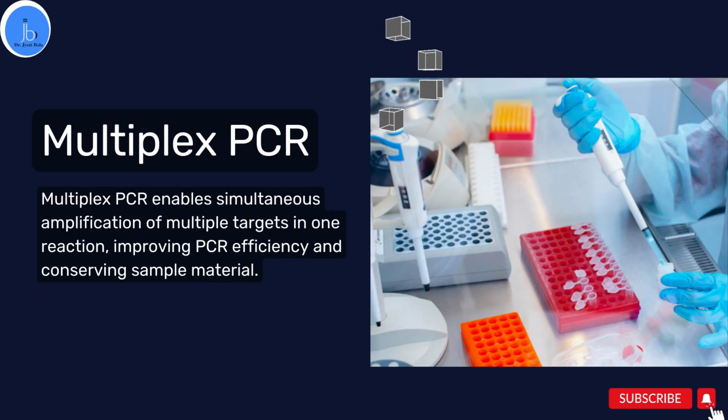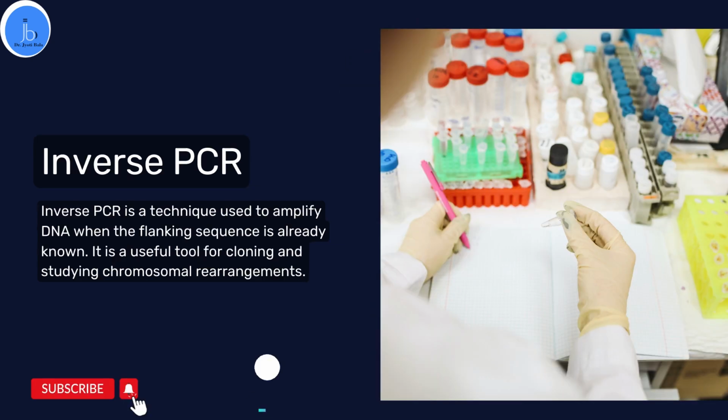Another one is your multiplex PCR. Multiplex PCR enables simultaneous amplification of multiple targets in one reaction, thereby improving the efficiency and also helping us in conserving crucial samples. The next one is your inverse PCR.